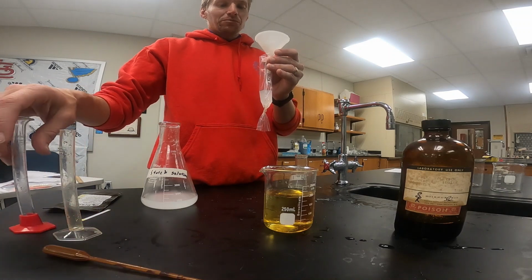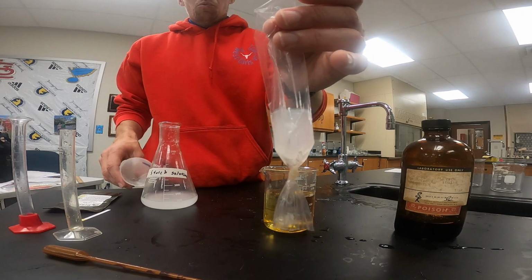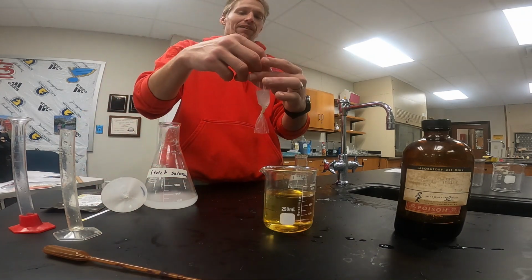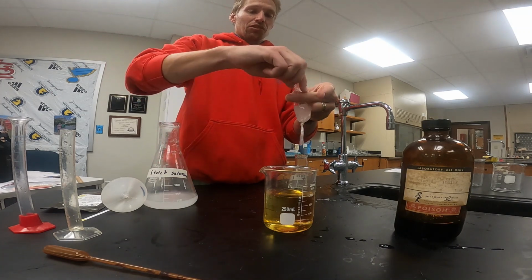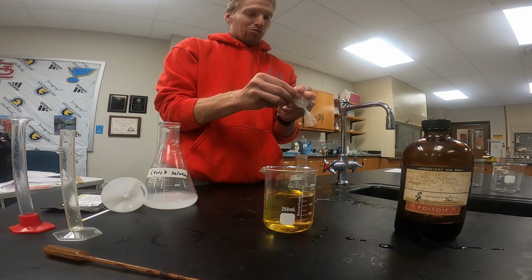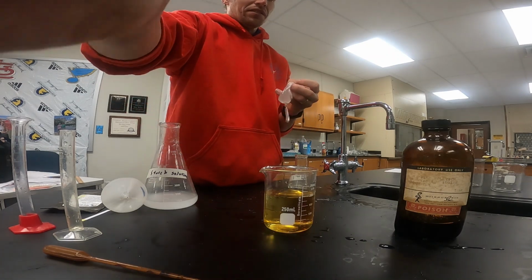If we're doing an observation for the appearance of the bag, you can see it's kind of a cloudy white appearance inside the bag. Then we tie up the top, and then we'll drop the bag into our beaker. So I'll tie up real quick and rinse it off, and then we'll drop it in, and we'll catch you then.